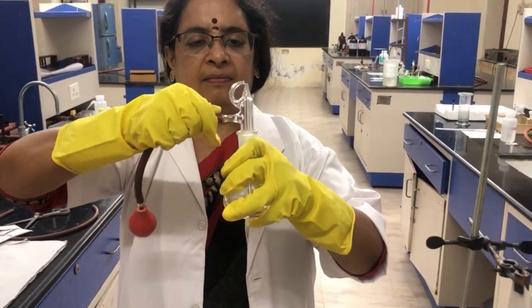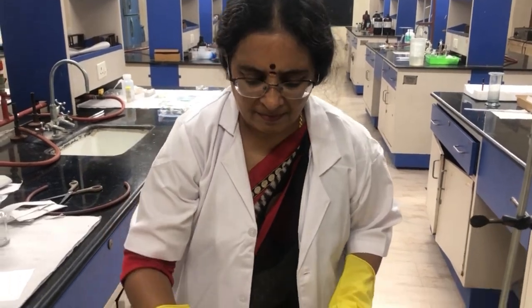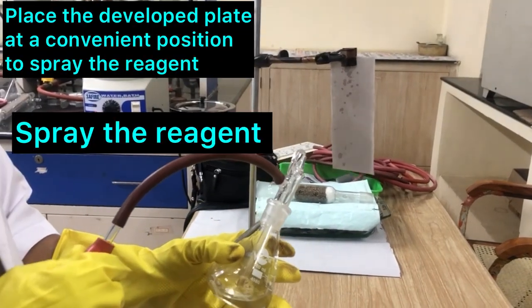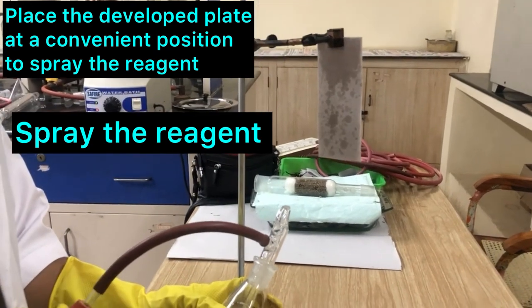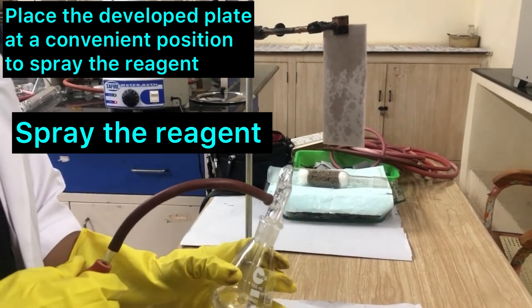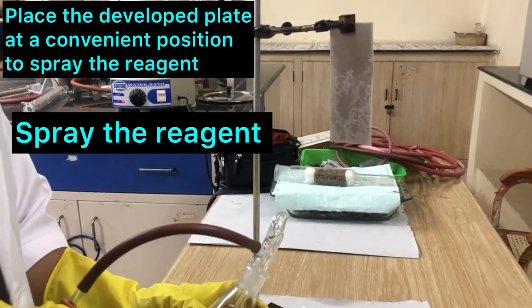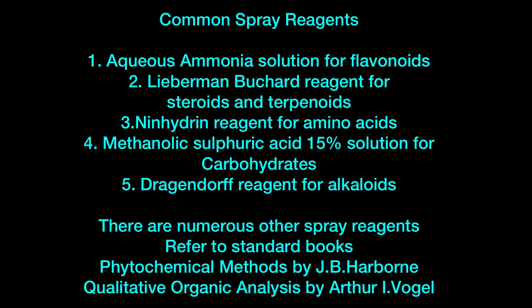Now we will see how to spray it. Secure the paper chromatogram or the TLC plate in a suitable place and spray it by pressing the rubber adapter. The sprayed plate has to be dried — usually in an air oven. After drying, colored spots will be seen.